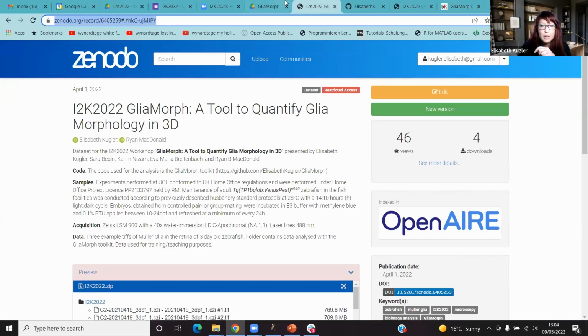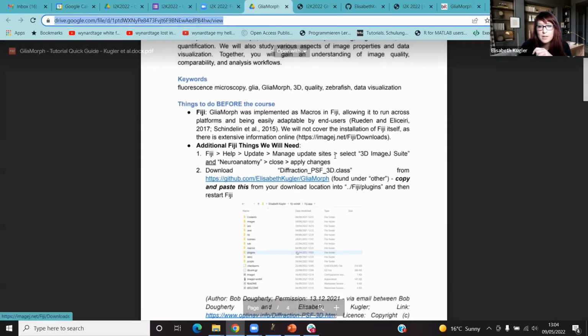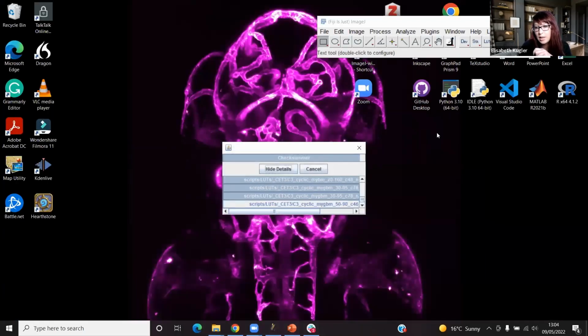They are specified here, and you can do this with Fiji update. It's running a lot of stuff, I'm sorry. Might not run that much stuff for yours.